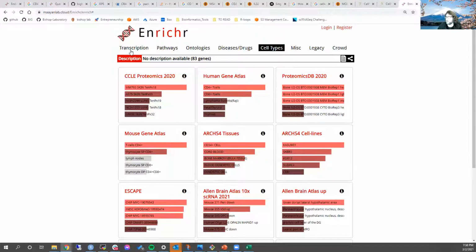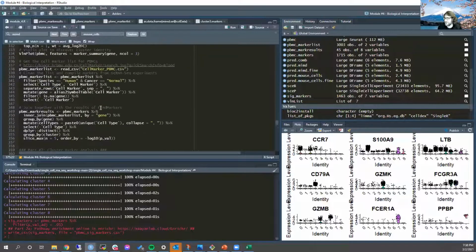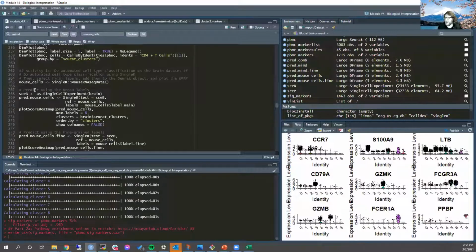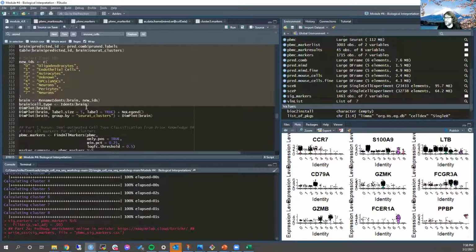Okay, Mauricio, I forgot the code for 1C. I'm so sorry about that. Thank you for reminding me. I'm going to forget that every single time. I'm certain of it. Hopefully this will all paste. I know there's a limit.